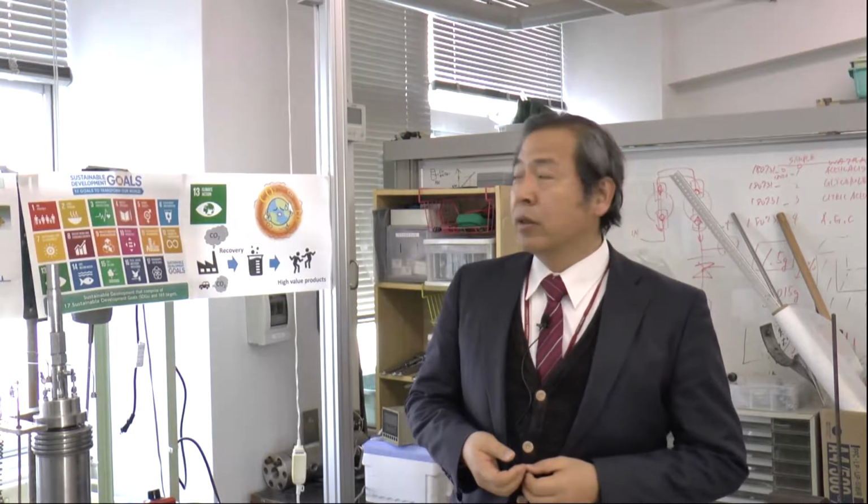Hi everyone, this is my laboratory. We can produce a very expensive, high quality substance. This substance is environmentally benign and good materials. And our goal is sustainable development.